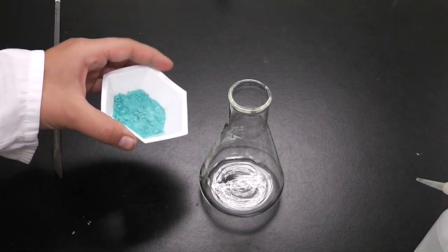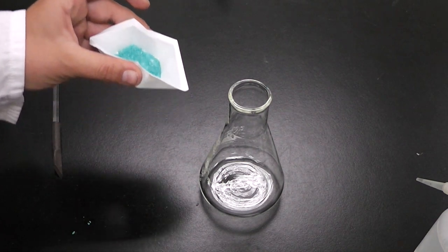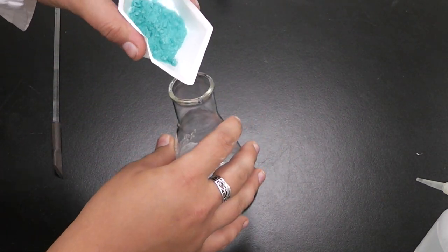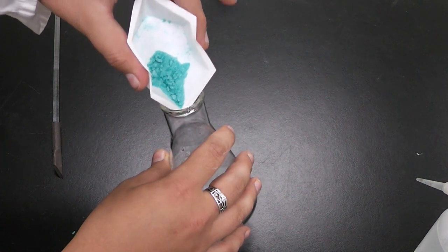To quantitatively transfer your sample, first you must squeeze the edges of the weighing boat and gently tap as much of the sample into the Erlenmeyer flask as you can.